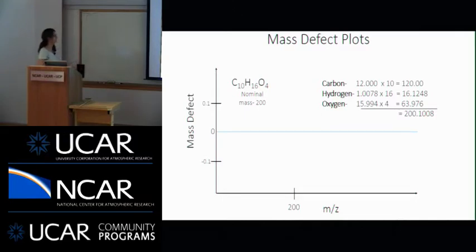So in this case, the molecular weight is about 200.1. You can tell that it has a mass defect, being the difference between the molecular weight and the nominal mass, of 0.1. So this molecule would lie on the mass defect plot right about as a dot right here. On the mass defect plots I'm about to show you, every single ion that we measure in the mass spectrometer is a single dot, and they have all been calculated this way.